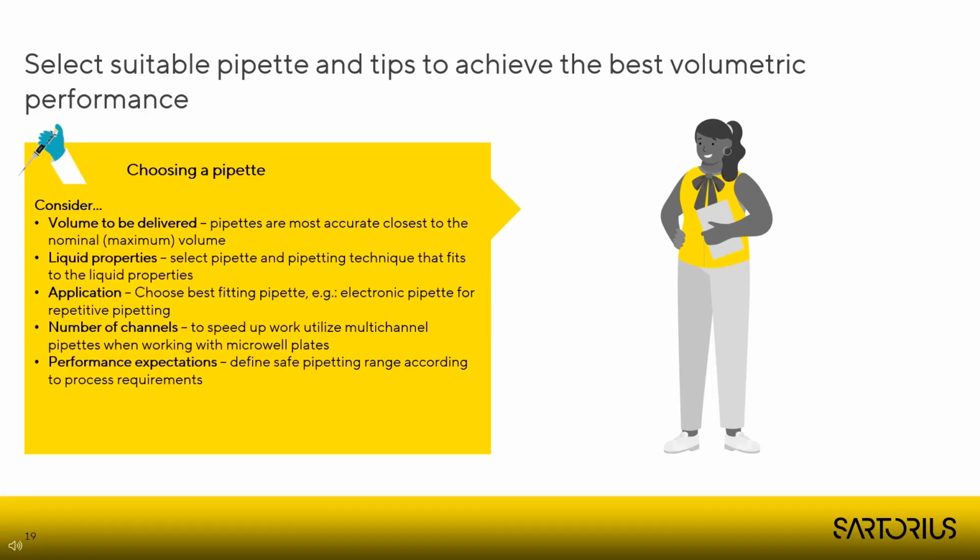Pipettes are typically used for a long time, even more than 10 years, or even more than that, I've seen. The manufacturing and logistical choices don't have such a large impact overall, though every bit counts, and reducing, for example, the packaging size can reduce the transportation impact quite significantly. Just make sure that the pipettes you've chosen have spare parts available, as well as service and calibration, so they will function many years to come.